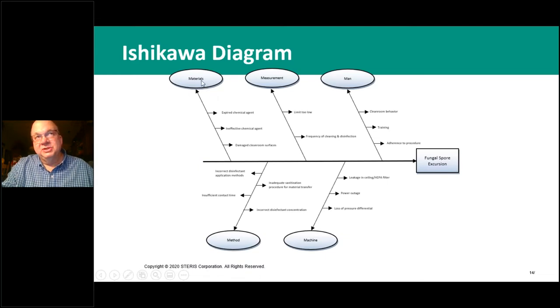How are the materials brought into that clean room? How are they decontaminated? We've done studies and published data in the PDA journal and the PDA book chapters to show that using a sporicide like a hydrogen peroxide peracetic acid chemistry followed by IPA increases the efficacy, so it's a synergistic effect at killing molds on surfaces.